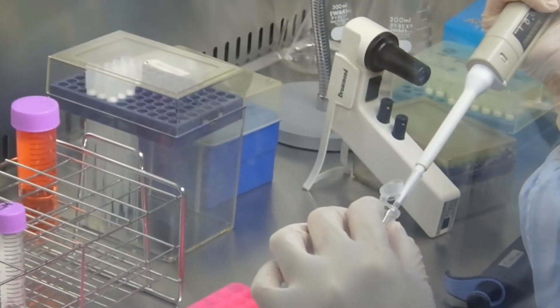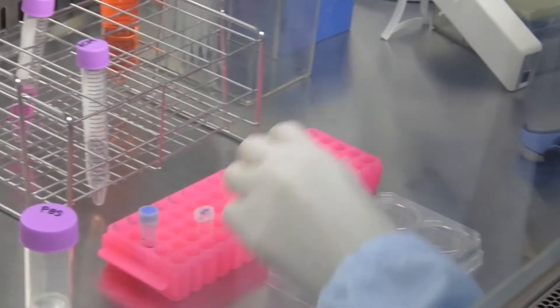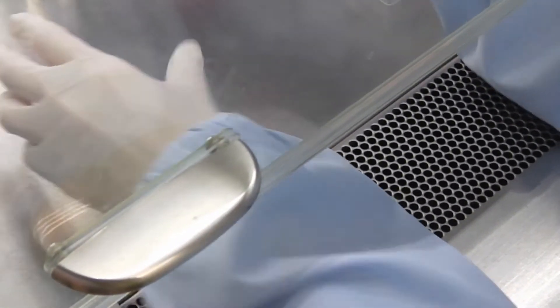Sample 10 µL of cell suspension, mix with an equal volume of 0.4% trypan blue solution, and measure cell density with a cell counter.